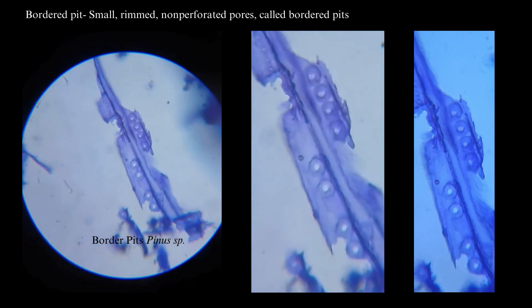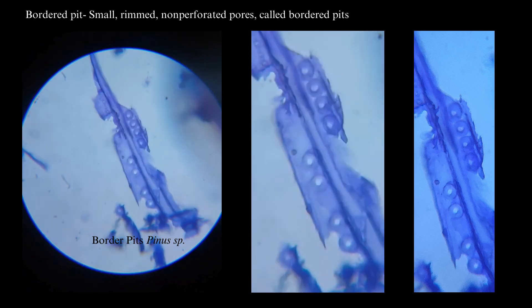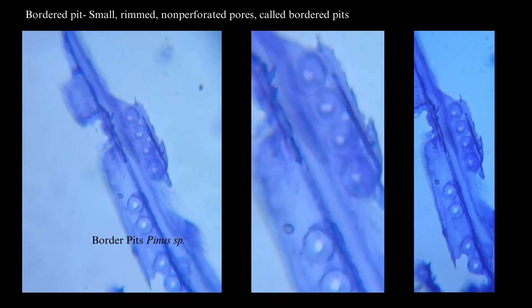This is the tracheids of pine wood. Here you can observe a wall pattern called bordered pits — a pit pair in which the pit chamber is over-arched by the cell wall, creating a larger pit chamber and a smaller pit aperture.